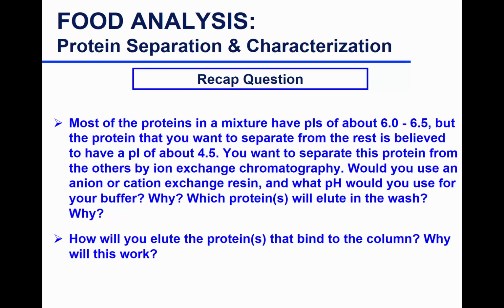So it will be held back. Everything else will just move forward and elute in the wash. In the wash, that means in the void volume. It's the same kind of term, two different terms for the same thing. Okay, so we kind of answered all of these parts.